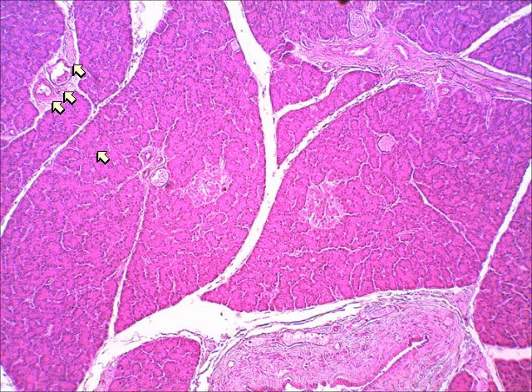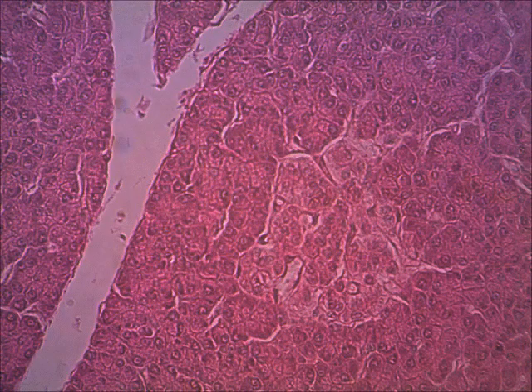Instead, let's see if we can find some more pancreatic islets. There's one. We'll circle this one. On this view, that's about the only one I see. This possibly is one. We'd have to look at that on a higher view. I might be seeing red blood cells inside of that, so that would be a blood vessel. Let's look on another view. We move to another slide.